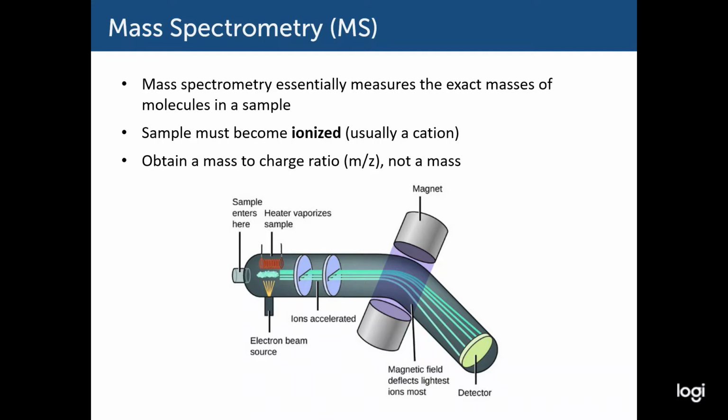So basically what we're looking at is where this charged particle impacts the detector correlates with the mass of that particle. So we're basically looking at addresses on this detector screen where charged particles will hit, and we can correlate where those hits happen with mass. But we don't actually obtain a mass directly. It's not like we can get from the instrument something like 109 grams.